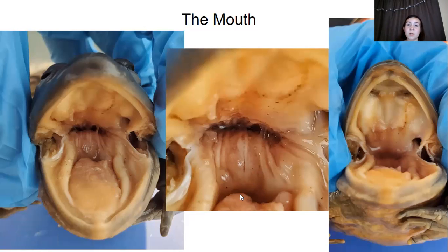This part is the glottis. And the glottis actually has a wonderful function where it opens and closes. This is determined by whether the frog is inhaling air or swallowing down food. So when the frog inhales, the air or oxygen filters down through this hole and it is open. If a frog is swallowing food, it's going to close so that no food gets in the lungs. And then down there, this part here, apologies again, is the esophagus, and that's going to lead down into the stomach.